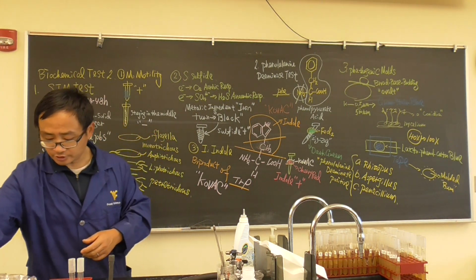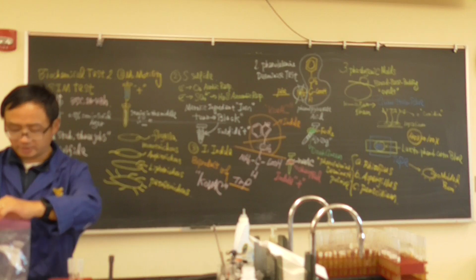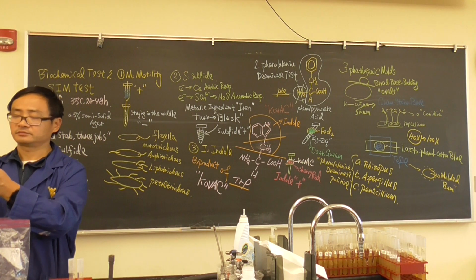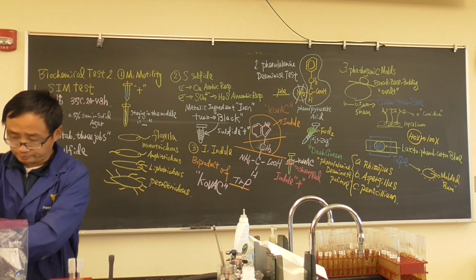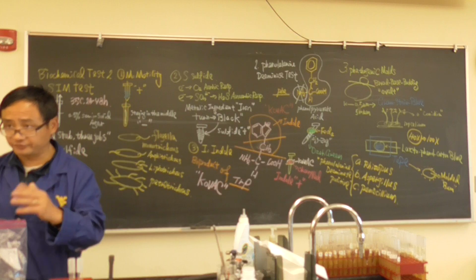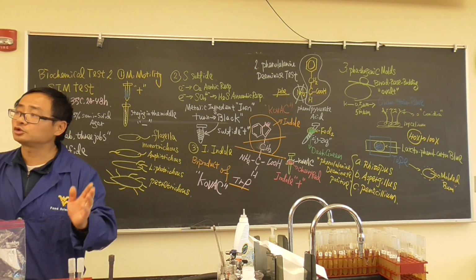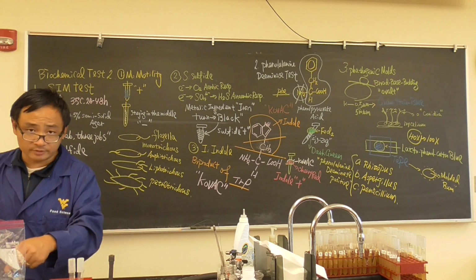Now, how to do this? You absolutely need to wear gloves. Then you come here and we use a tape. The tape will be like this. You touch it and have your glass slide ready, then you press it. In the middle of the glass slide, we'll have the lactophenol cotton blue. And then you go ahead and do the observation. Two of you can have one representative do this, because it is really moldy.